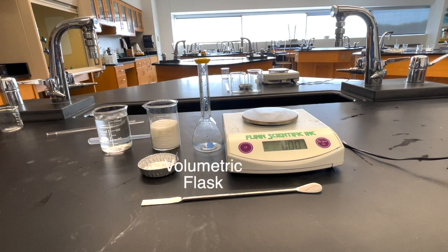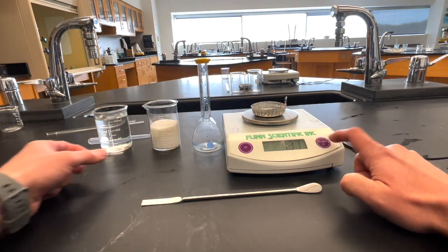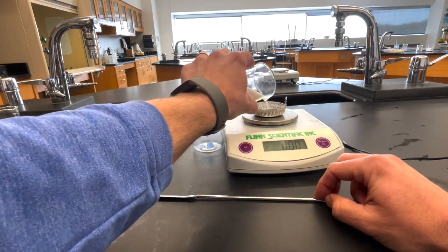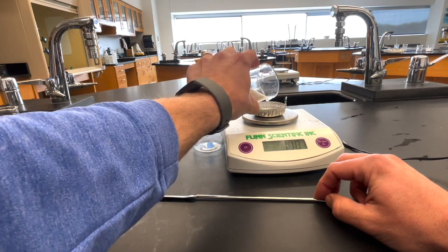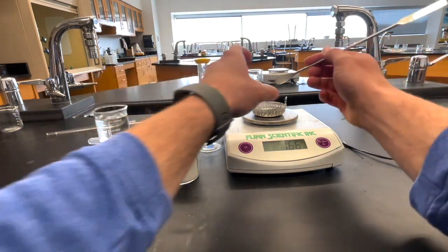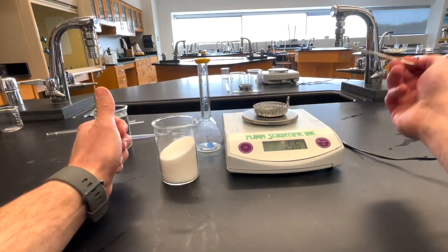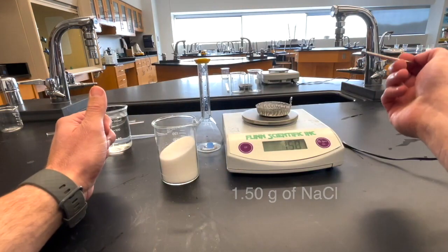What you'll notice about a volumetric flask is that it only has one marking on the neck, which is exactly the volume that is listed on the outside of the glass. In this lab, I carefully measure out exactly 1.5 grams of sodium chloride because I want to make a solution that includes 1.5 grams. I want the solution's total volume to be exactly 100 milliliters, which is why I use a 100 milliliter volumetric flask.